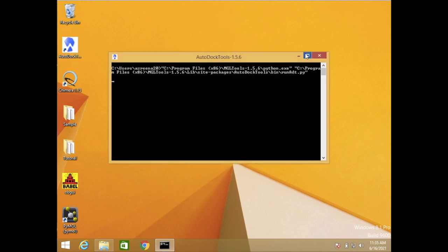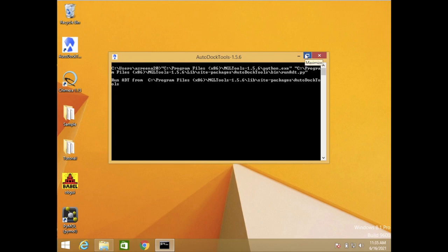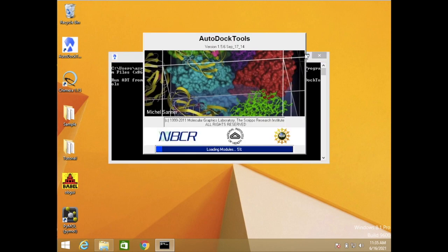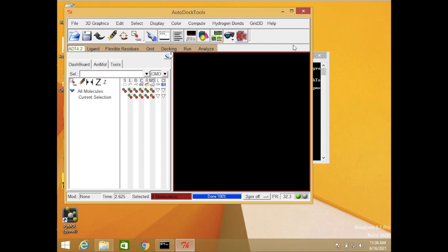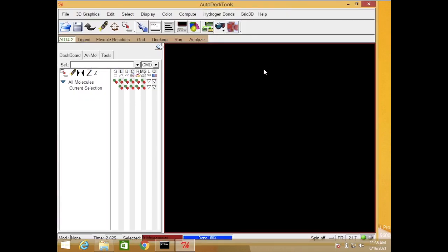So AutoDock Tools is used to remove some of the ligands or any extra structures that we do not need. In this case I will remove the water molecule and also chain B, and we will only use chain A in this structure. Let me open the AutoDock Tools now.